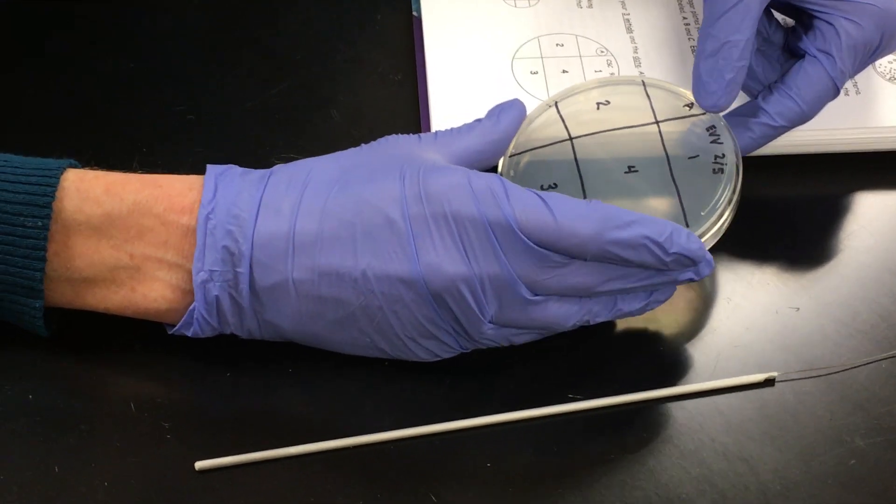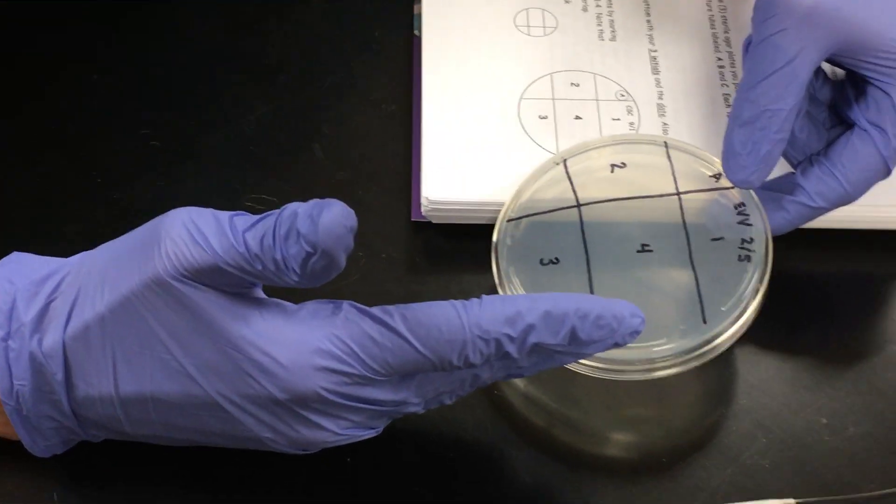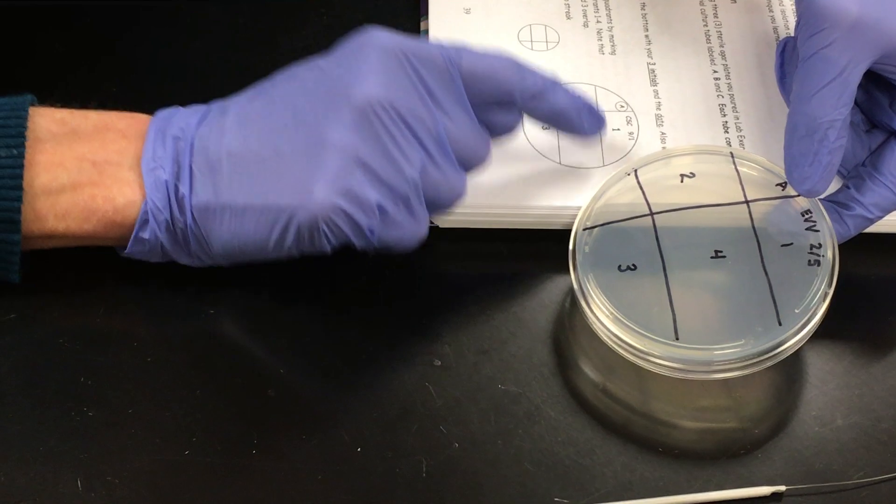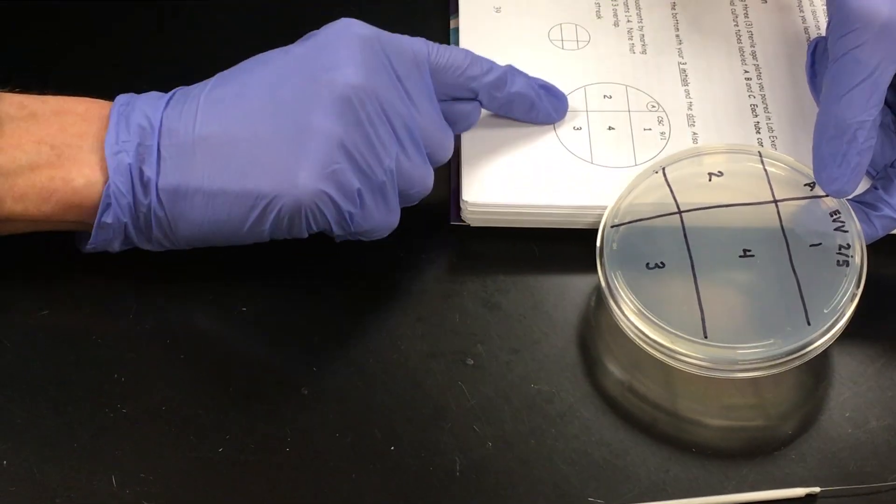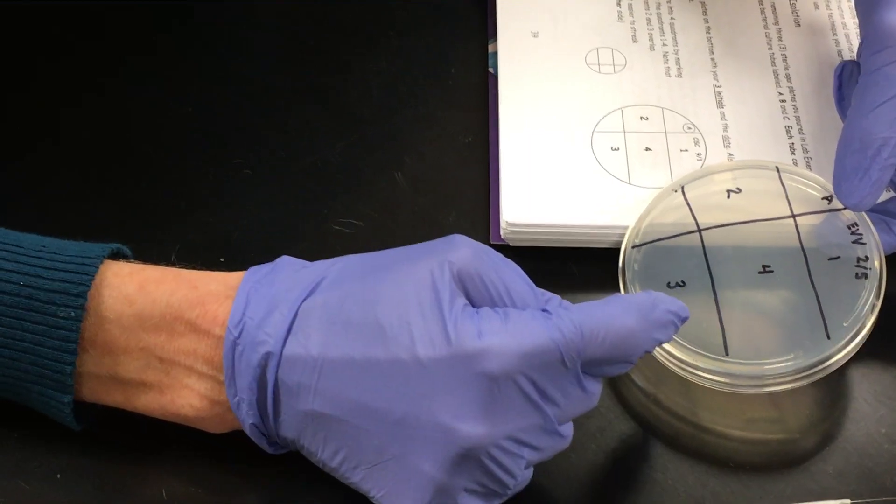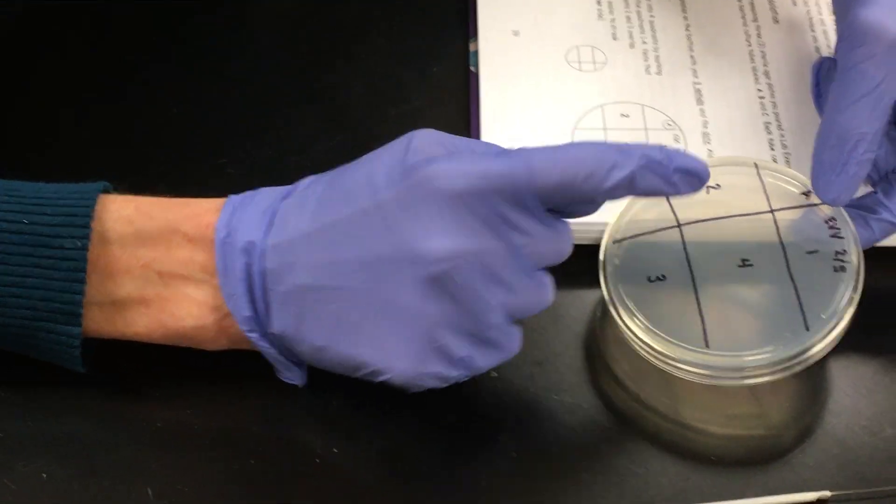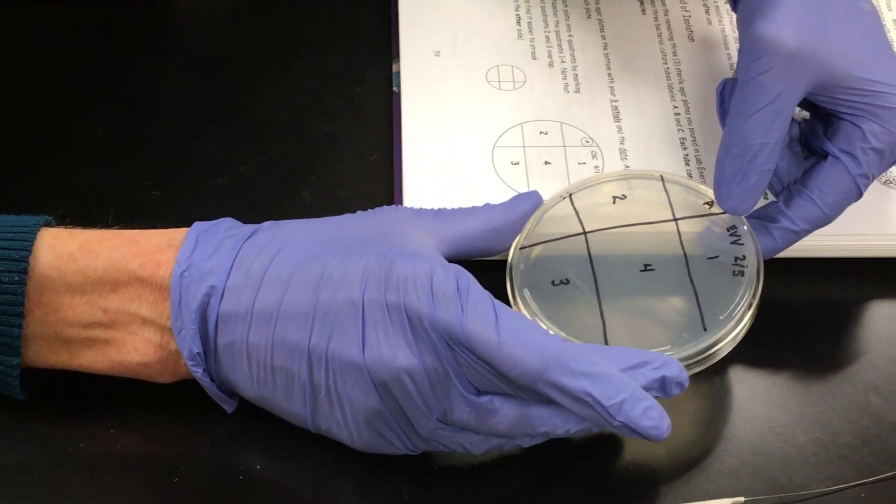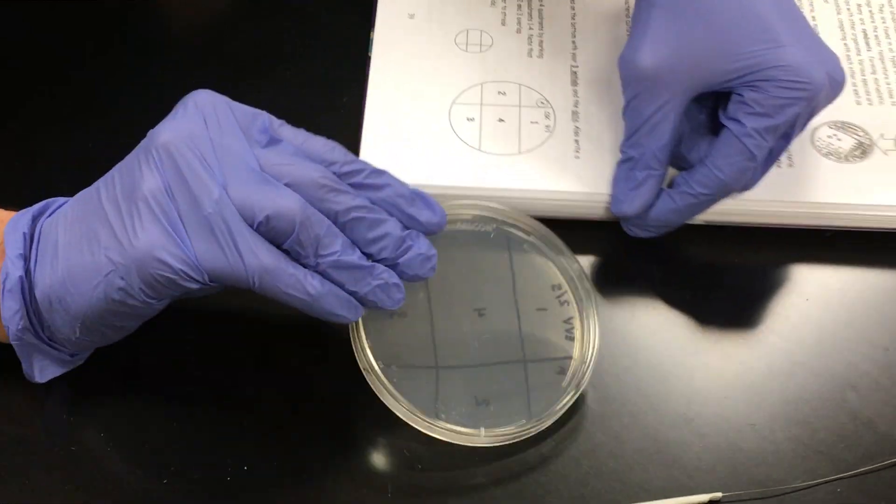When you draw your lines think of them in thirds. And so this is a third, this is a third, and we're drawing this about a third. And then you're going to label your quadrants one, four, three, and two. And once you have it labeled just like this, then you're going to turn it over.